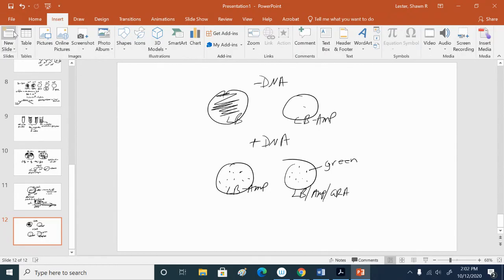This plate here shows us gene regulation, because the bacteria are also growing in the presence of ampicillin, but we have fluorescent green colonies, which means the green fluorescent protein gene has been turned on. It's turned on because we have arabinose in the agar, and the bacteria are making the araC protein.